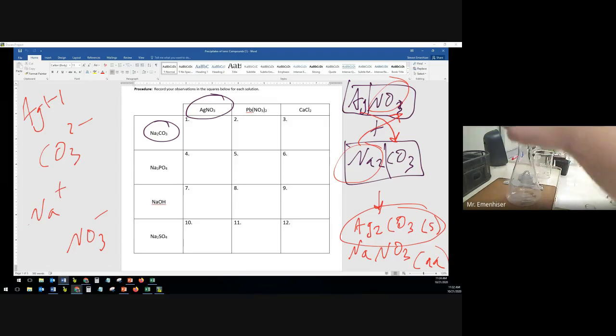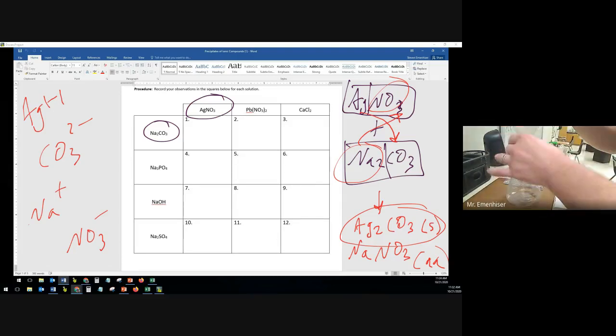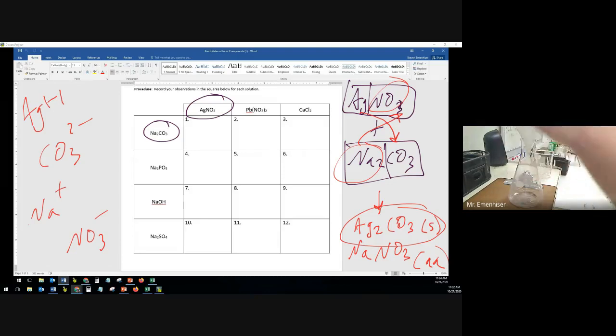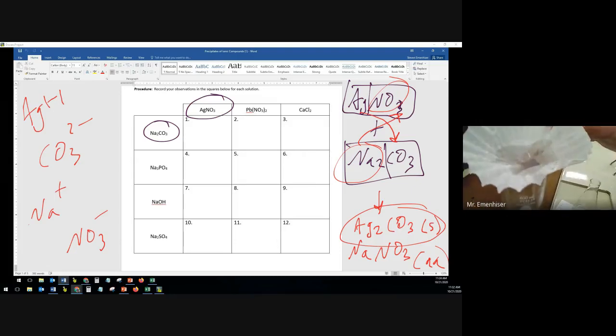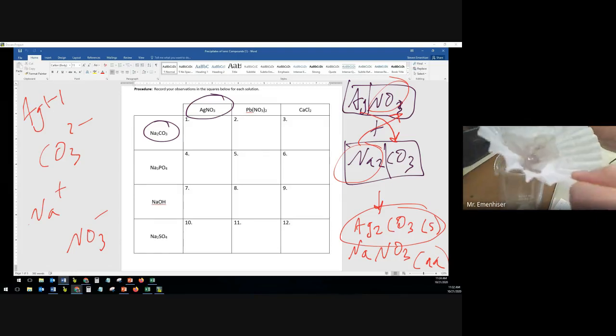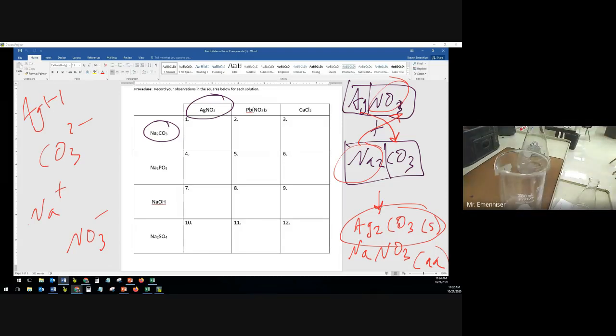But if we look here at our filter paper, I don't know if I can get a shot of this without making a mess. I will try though. Let's see, put my filter paper, my beaker there. So if you can look at this, you can see this kind of brown, liquidy, solid stuff. Okay, and that's our precipitate. I'm trying to filter it, and I'll show you guys the filter a little later. So I'm going to leave this one like that and let it sit there. So this is number one. Actually, I can totally leave that there. That's totally fine. All right, let's do number two.